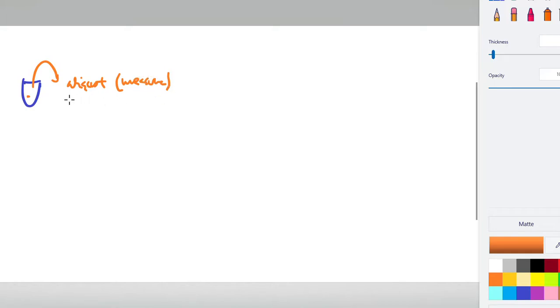Well, okay, this is great and all, but this is what we would call a fixed time or a one-point time. That's all that we're doing. So if it's 60 minutes, drop the pill, let it spin, come back in 1 hour, and take an aliquot out of it. We have only pulled one point. We're analyzing that one pull, that one aliquot, and no other questions are asked. However, dissolution can also be used in a different way.